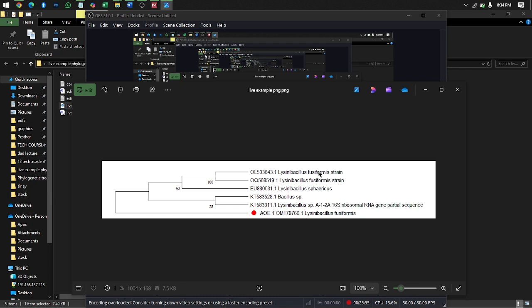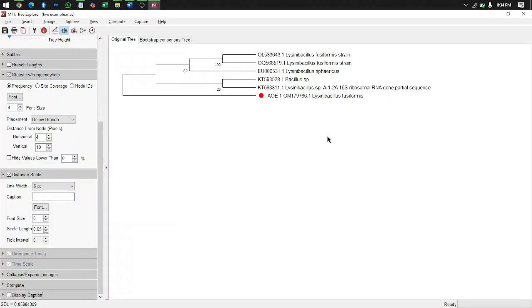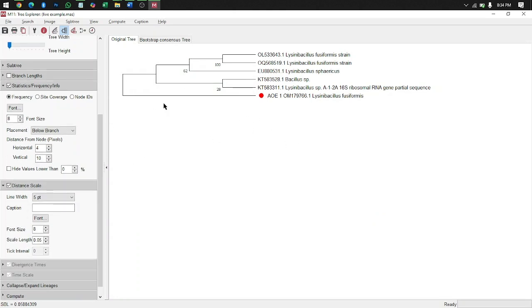Then if you want to turn it to PDF, you can import this to your Microsoft Word to give it a better look. And if you want to save it as a PDF directly, you can also use PDF tools online. Just search for convert image to PDF. Then you find the tools. That's the basic way, sir.